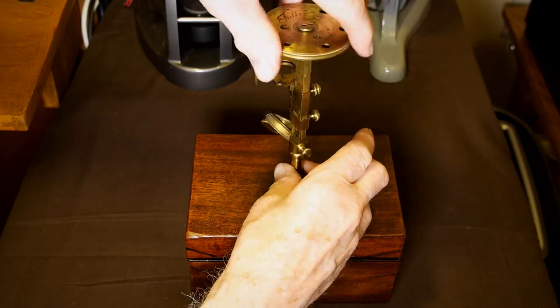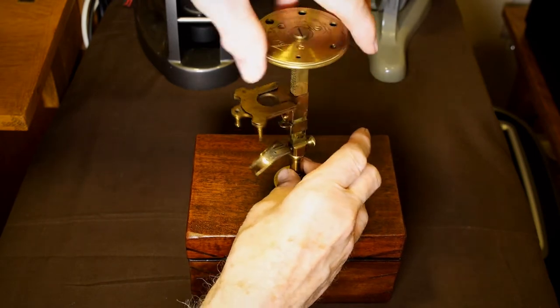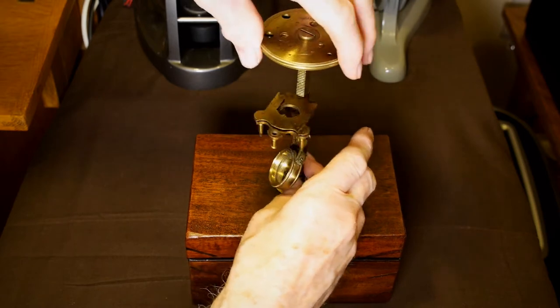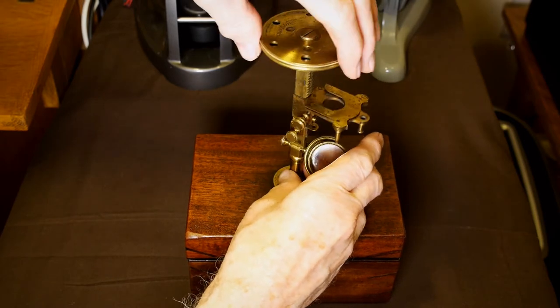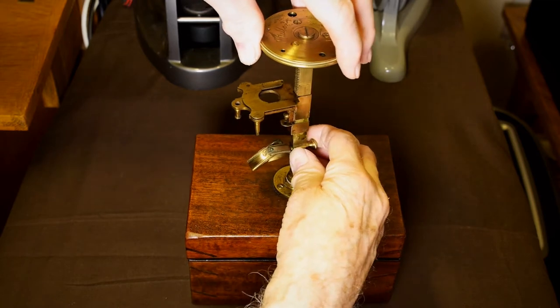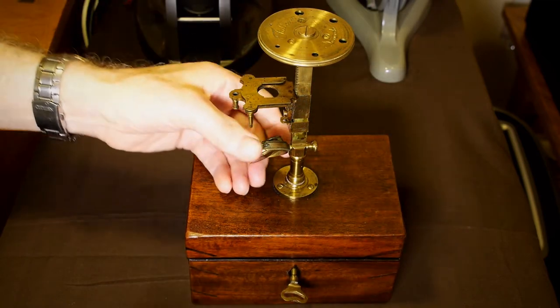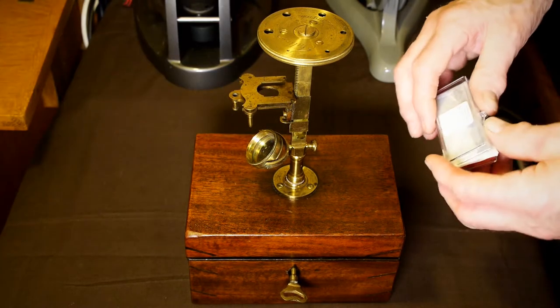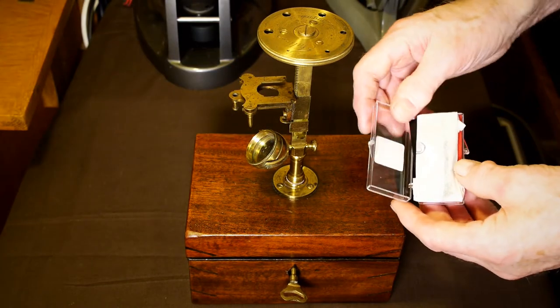Stage plate focusing is achieved by means of a rack and pinion. The microscope's small size, somewhat difficult to operate coarse focus control, and general lack of rigidity requires some dexterity to use, making the locating and focusing of an object a rather hit and miss affair.